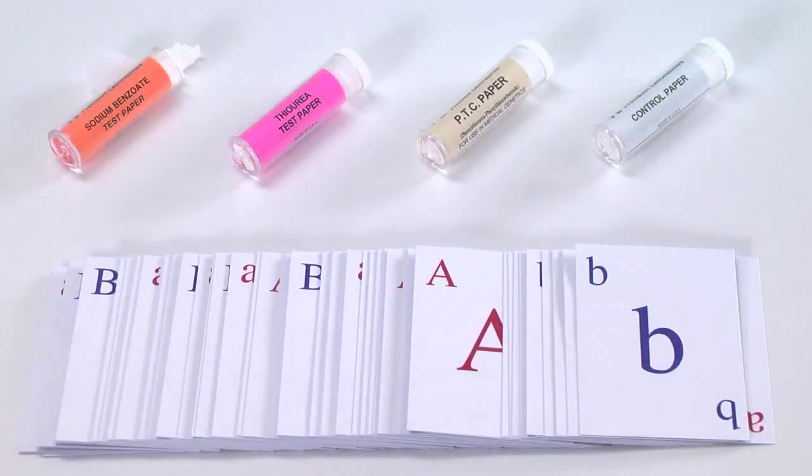Students can investigate population genetics in humans with the test paper strips that include sodium benzoate test paper, thiourea test paper, PTC test paper, and control test paper. Specifically, students can determine taste sensitivity for individuals of the population under study. The allele playing cards enable modeling of genetic frequencies in order for students to accomplish statistics demonstrations and investigations.